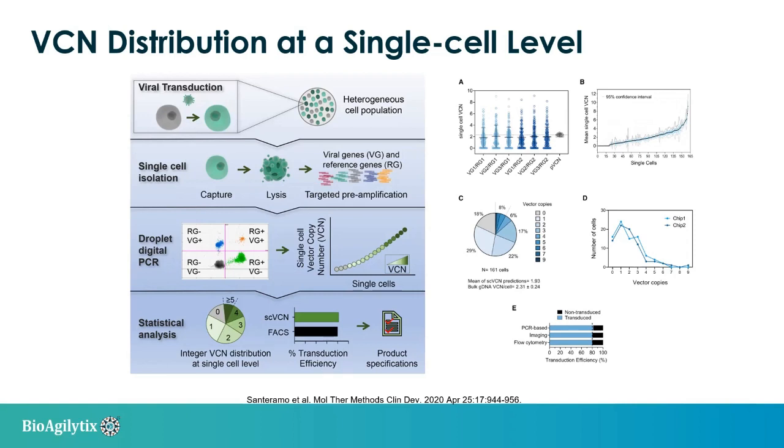This may have implications for product safety, and it may underestimate the presence of cell clones with a higher number of integrations. Those cells could persist and even replicate following infusion. It also lacks the resolution to monitor changes in the final product specifications.